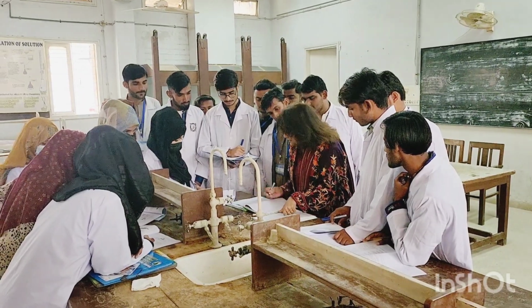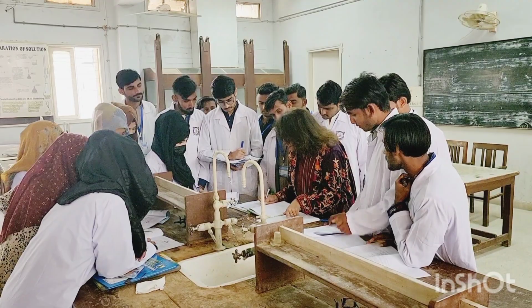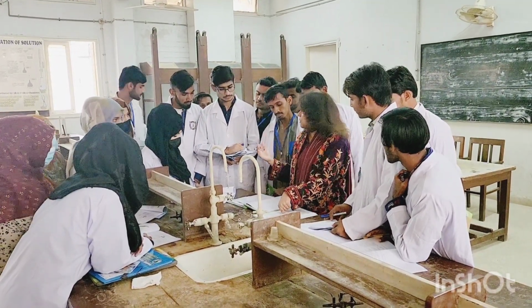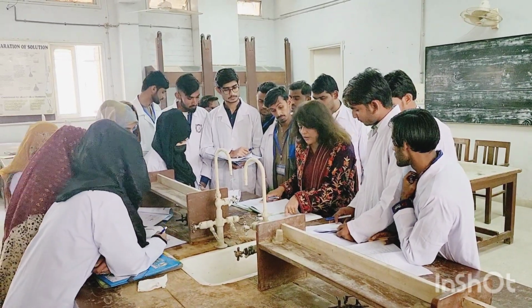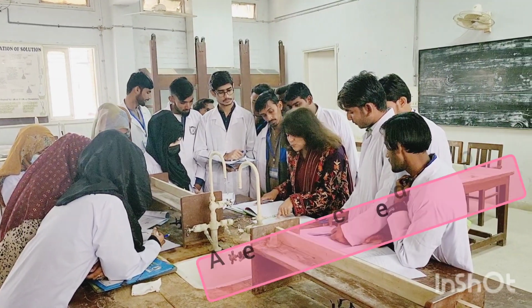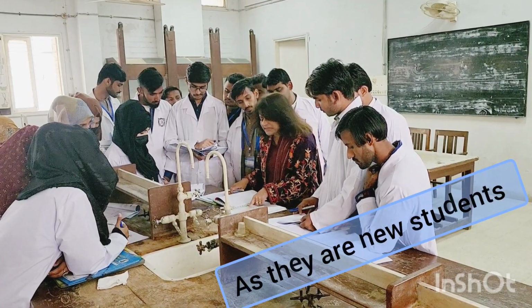Then the second, number 2, is color. Of course, you will look at your compound, and you will come to know whether it's white in color, whether it's yellow in color, what color it has. So according to that, white. Here they have given us the options: white, greenish, yellow. If it is white, then you will write down many hydrocarbons, aromatic compounds. They have given us the examples.